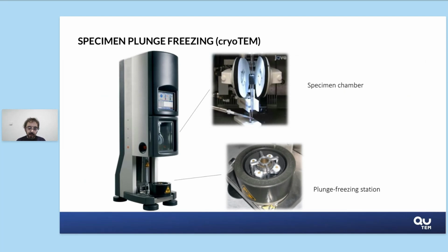But before that, I would like to show you a bit how cryo-TEM is done, just to give you more insight. So that's the machine that we are using for cryo-TEM preparation. You can see here that you have a specimen chamber, which is under controlled humidity, in which we apply the specimen, after which it's blotted away using these blotting tabs. And then we have a guillotine system that will directly plunge freeze the specimen into this small cuvette in the center.